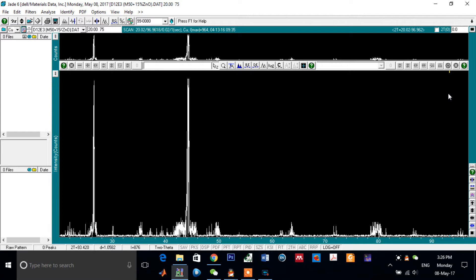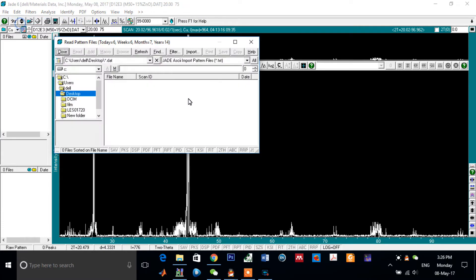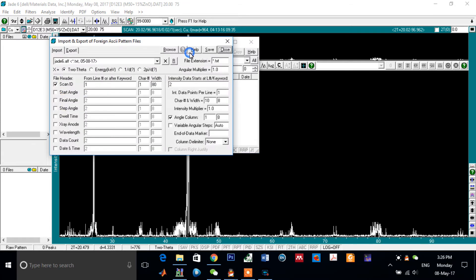To do that, click on File, Patterns, and click here on Import.